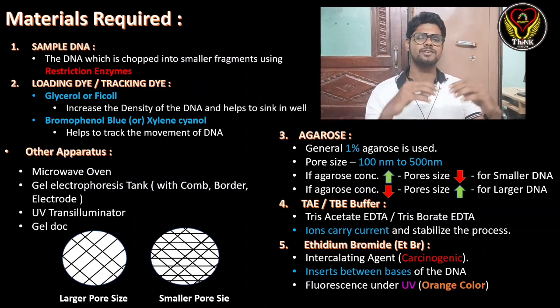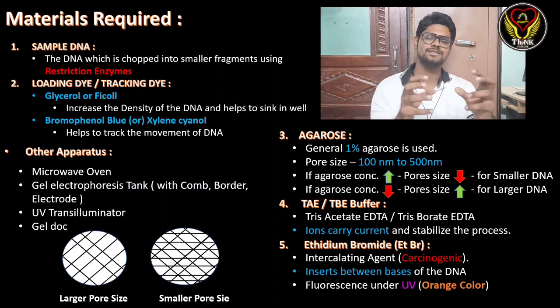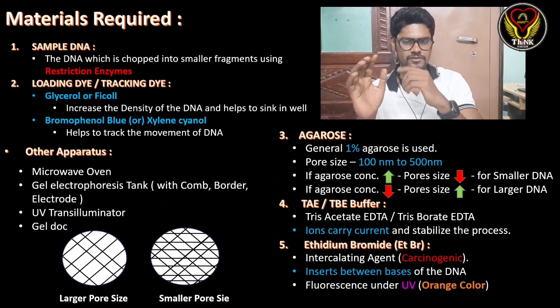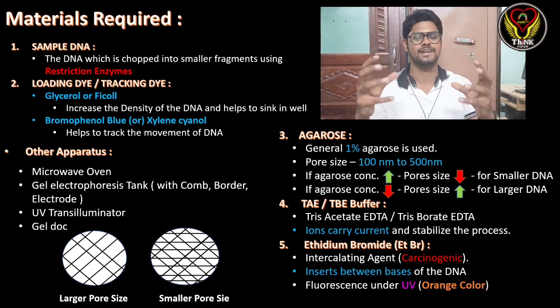Apart from that, we add a tracking dye, which is bromophenol blue or xylene cyanol. This will help to track where our DNA is. For example, if we are running for around 10 to 15 minutes, we can identify how far our DNA has traveled with this tracking dye.